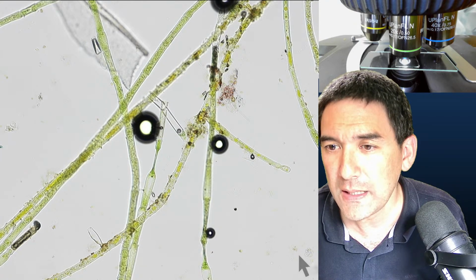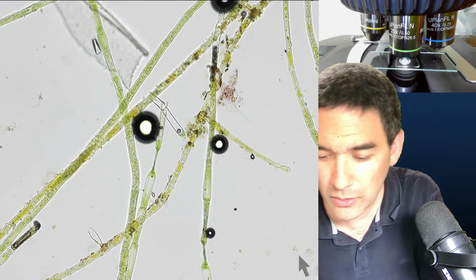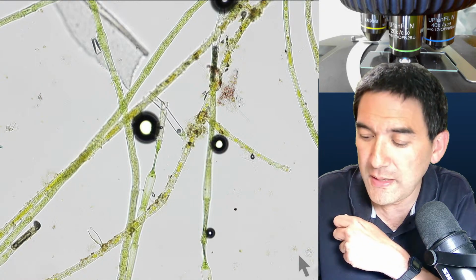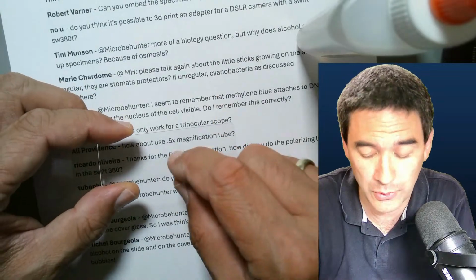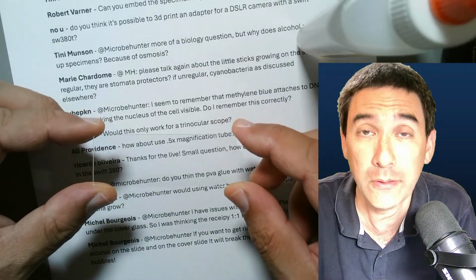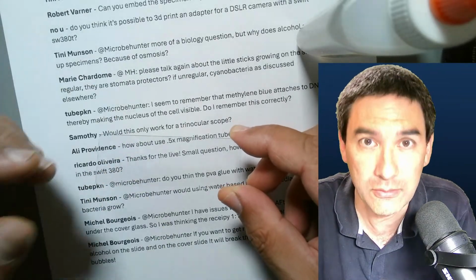Did you ever make a Feuchtekammer? The answer is yes. I need to explain what this is. Basically, let's say I've got some jars over here with some water samples, and you put a water sample and you make a slide. You put a water sample on here, cover glass on top, no permanent mount, right? And you see the little water microorganisms moving around, and you kind of want to keep the slide for a day, 2 days, a week maybe. The problem is it's going to dry up, right? And then everything's going to be dead, right? But you don't want that.